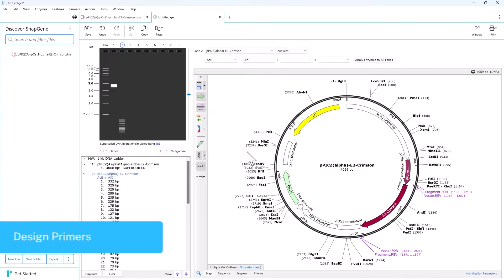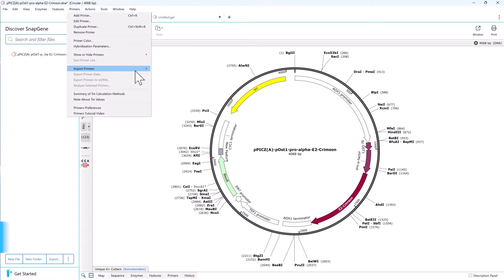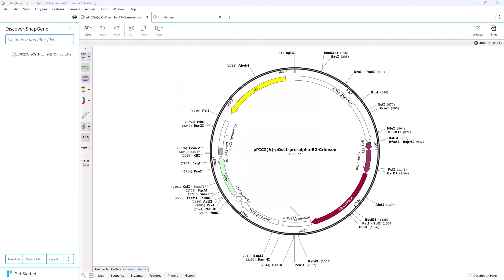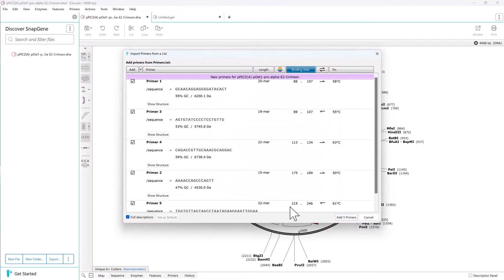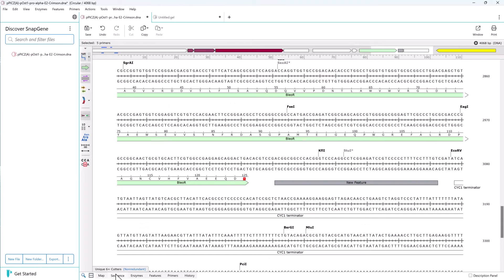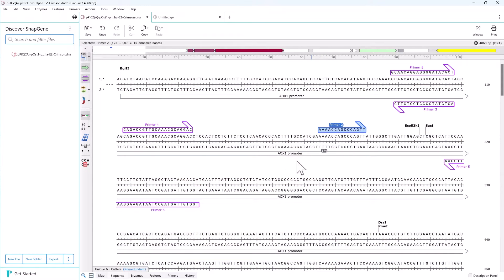SnapGene makes it easy to work with primers too. If you have existing primers, store these in a delimited list and import matching primers onto your sequences. You can view the primers on the sequence and as a list in the primers view.